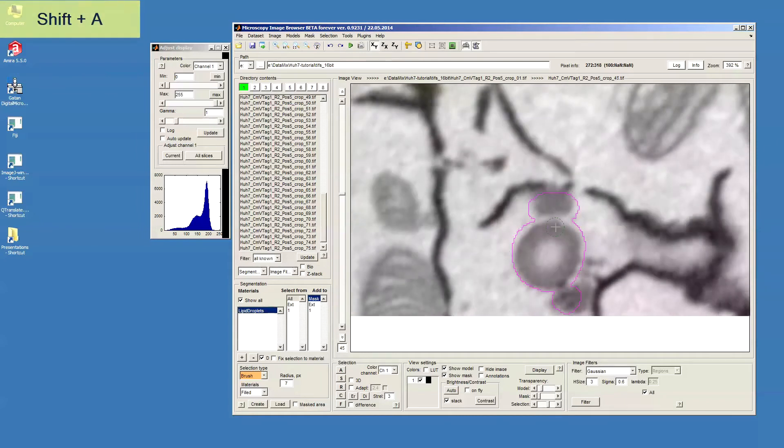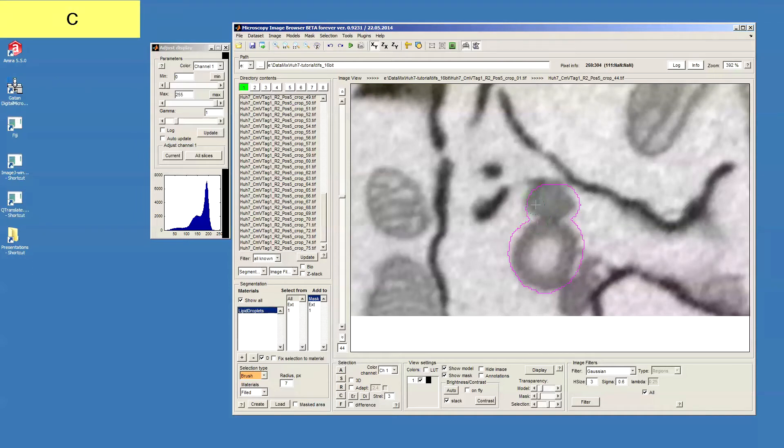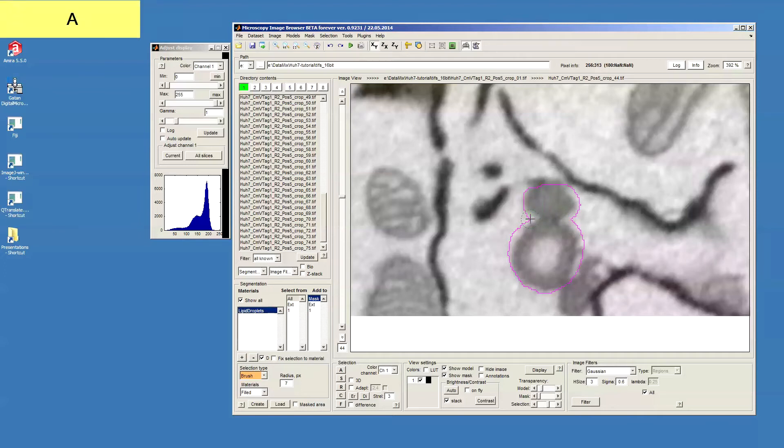So now we have basically three lipid droplets. Maybe there are some of them would have some areas missing. So we can again just do another selection and press A to add it.